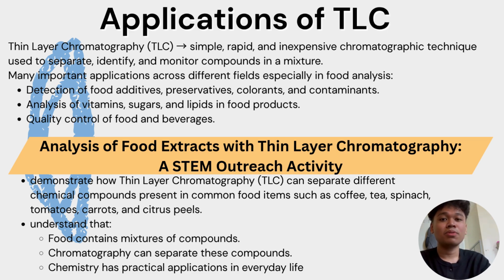TLC helps detect food additives, preservatives, coloring, and contaminants to make sure food is safe to eat. It is also used to analyze food components such as vitamins, sugar, and fat. Because of this, TLC is widely used in food quality control.